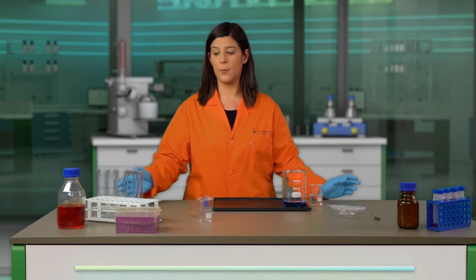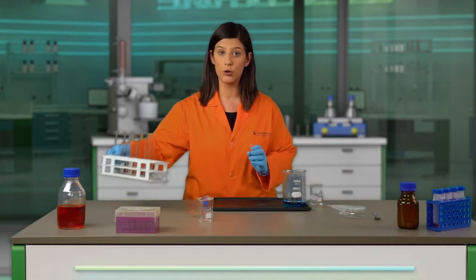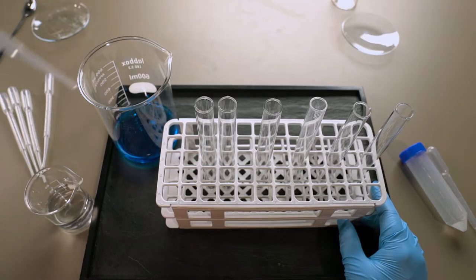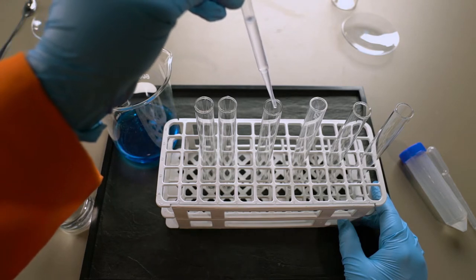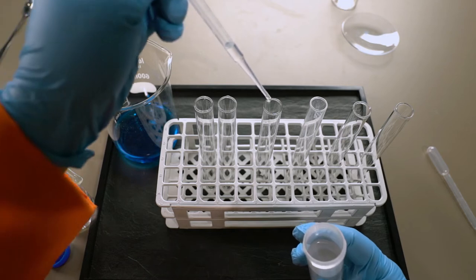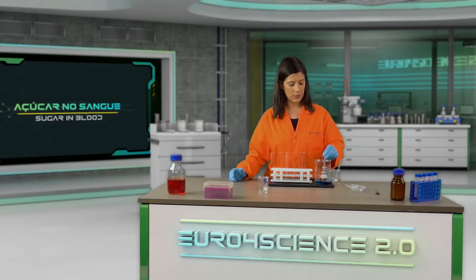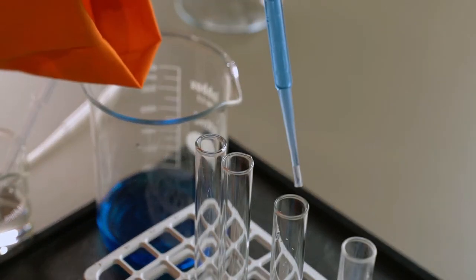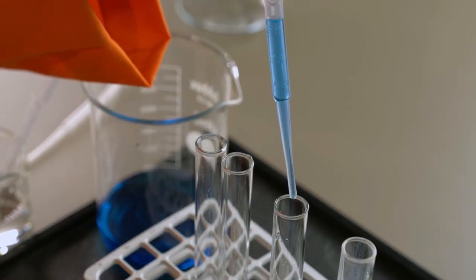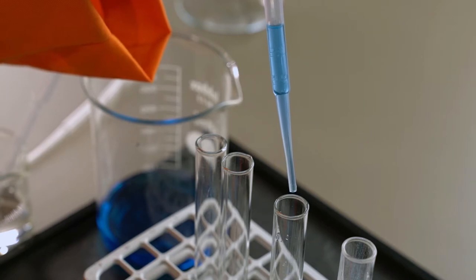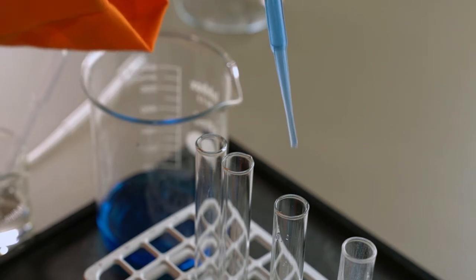Agora, temos de preparar a amostra para depois compararmos com a escala de cor construída. Com uma pipeta de pasteur, adicionamos 30 gotas de água a um tubo de ensaio e também 10 gotas da amostra recolhida. De seguida, adicionamos 10 gotas do reagente de Benedict que preparámos anteriormente. E, por fim, deixamos o tubo de ensaio em banho-maria até que ocorra a mudança de cor.